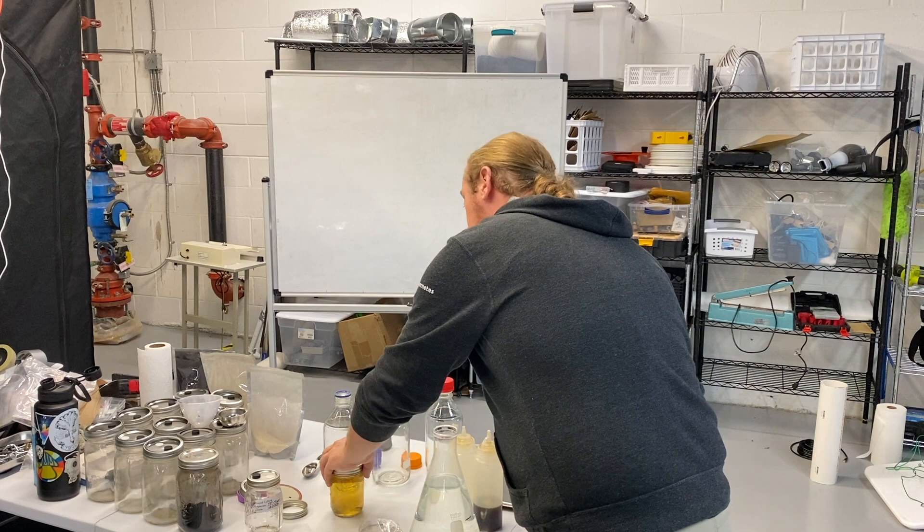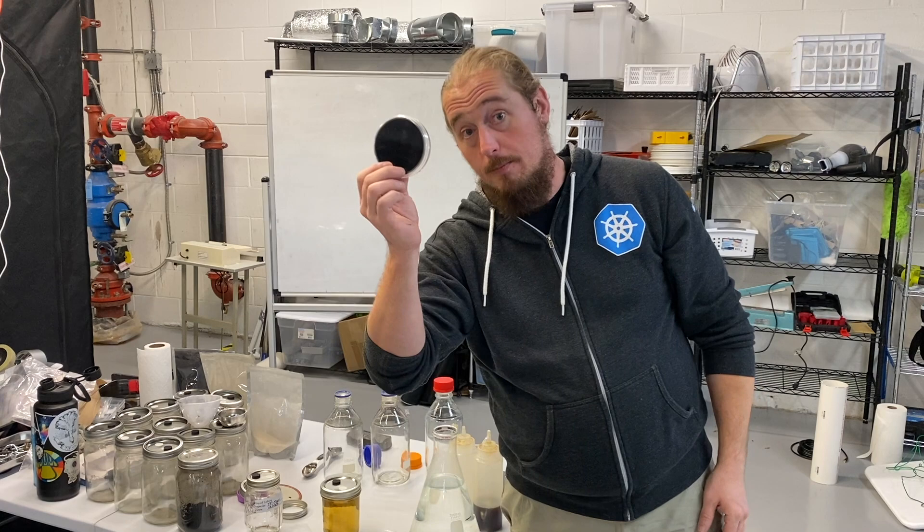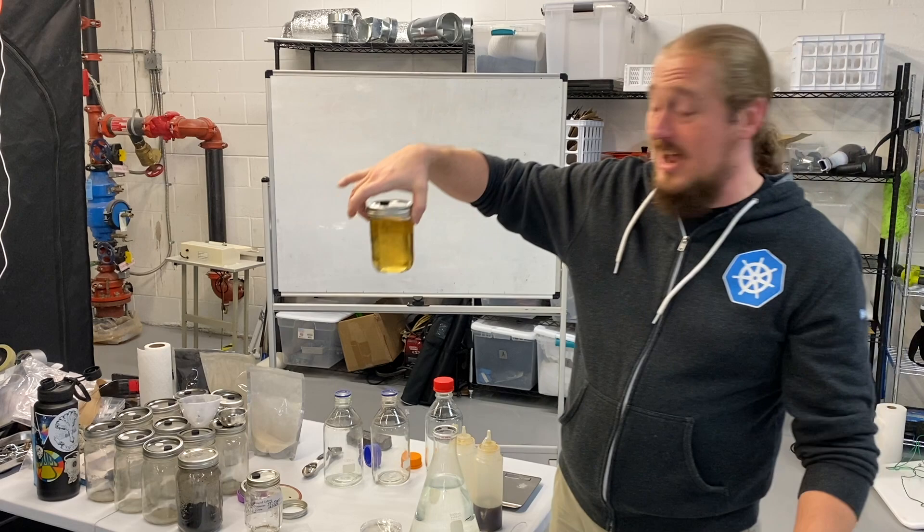The key thing to remember is that the only difference between agar plates and a liquid culture is that one of them has agar powder in it. If you added agar powder to your LC recipe, more than likely you'd get a solid mass of nutritional jelly.